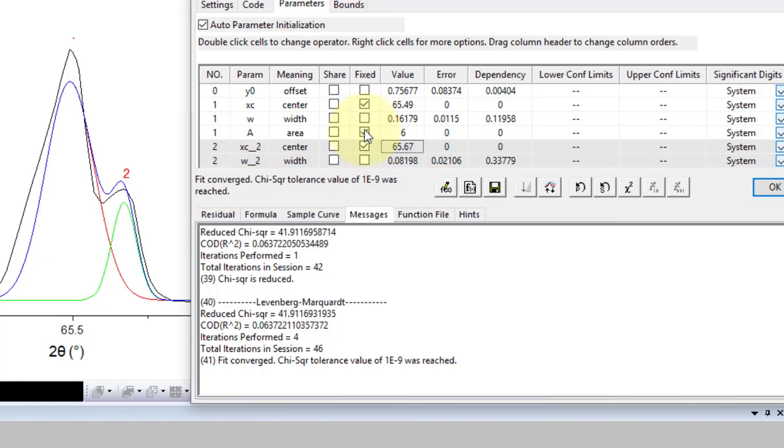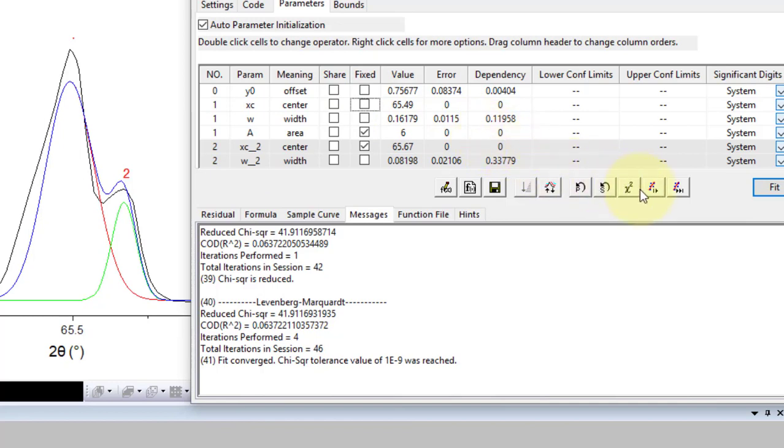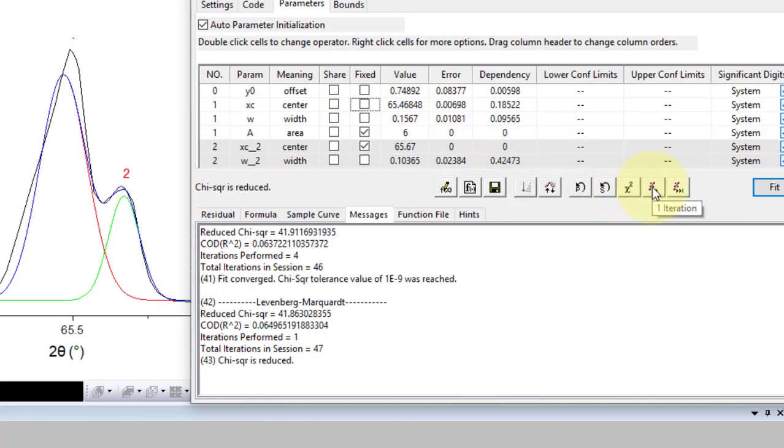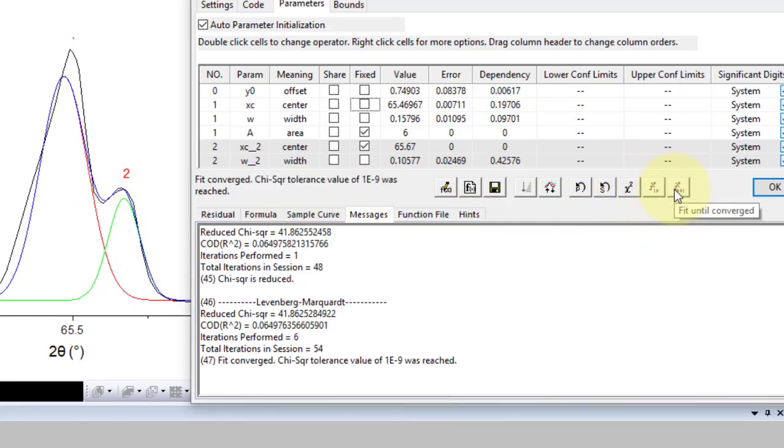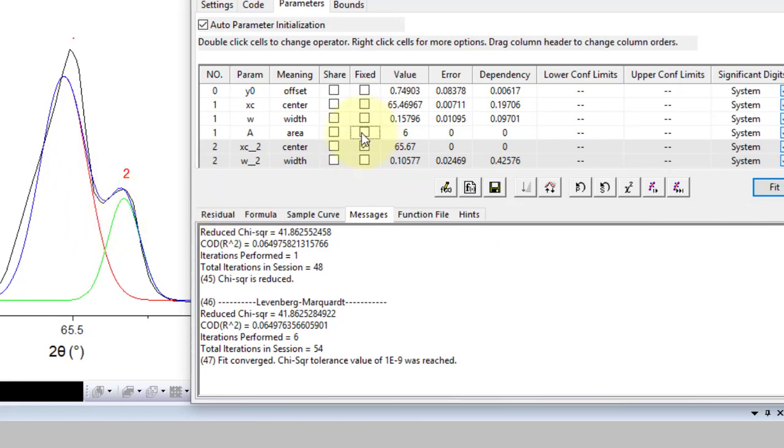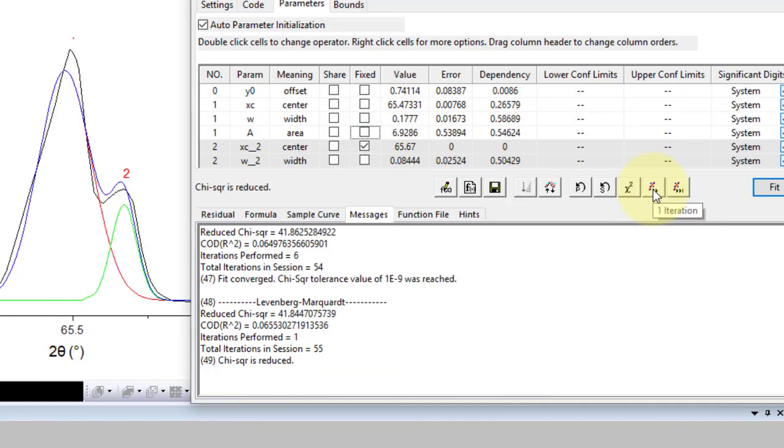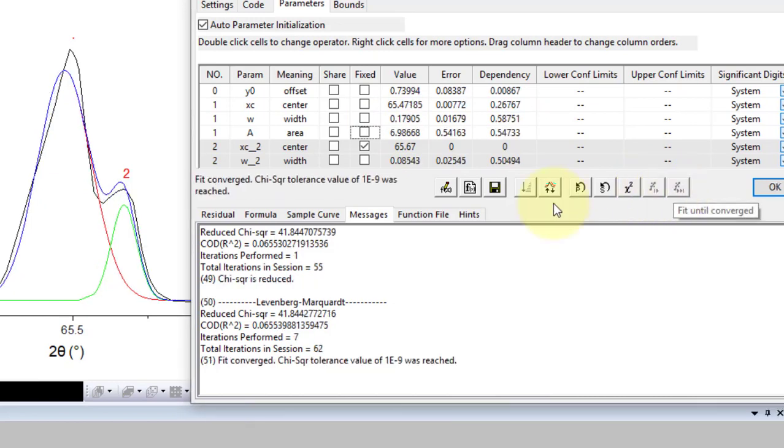Now let me release peak 1 position and perform the iterations. I see that fit has been improved. Now relax its width too. The fit is now reasonable.